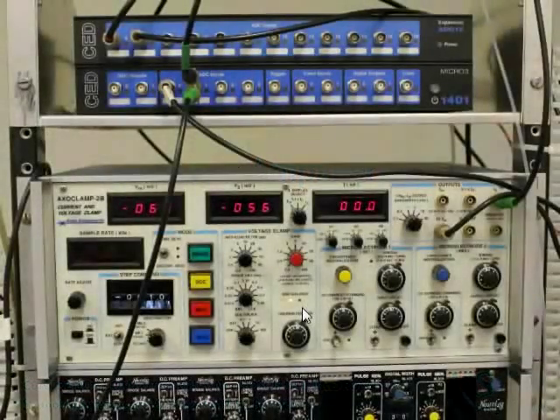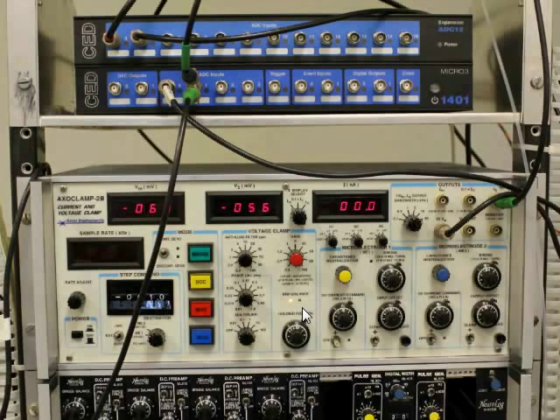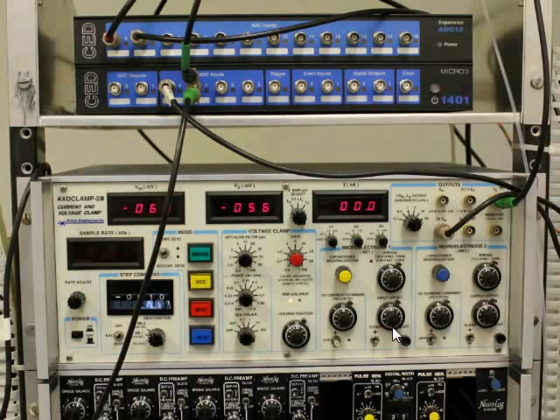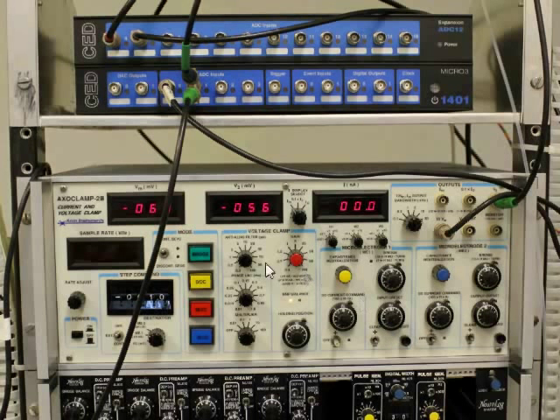In our experiments we used the AXOCLAMP 2B amplifier that you can see here. It probably shares many features with the amplifier you're using in your own lab. And what's important here is we're recording in bridge mode.